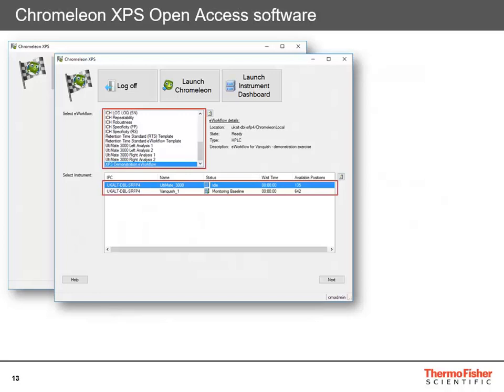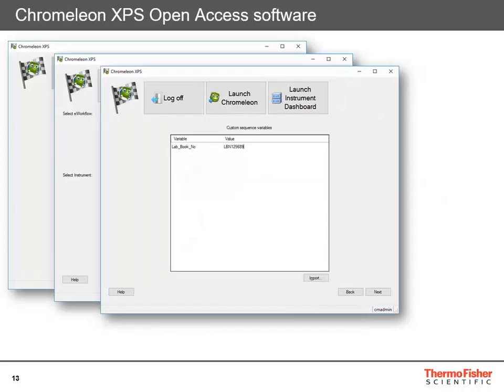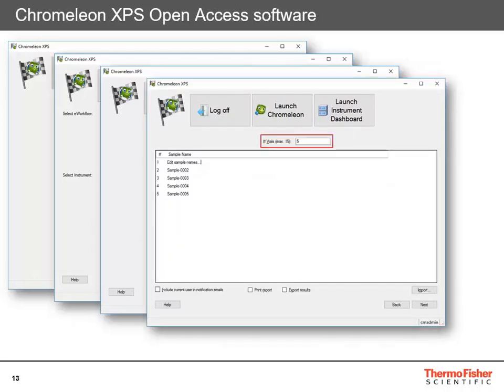You select your instrument and click next. If there are custom sequence variables to be added, the user is prompted for those. You then specify how many samples to add — the maximum is set by the e-workflow — and edit the sample names. If there are also custom injection variables specific to each injection, those appear in a table and can be edited. At the bottom, if not predefined by Chromelion Express management, you can choose to get email notifications, automatically print the report, or automatically export the results.